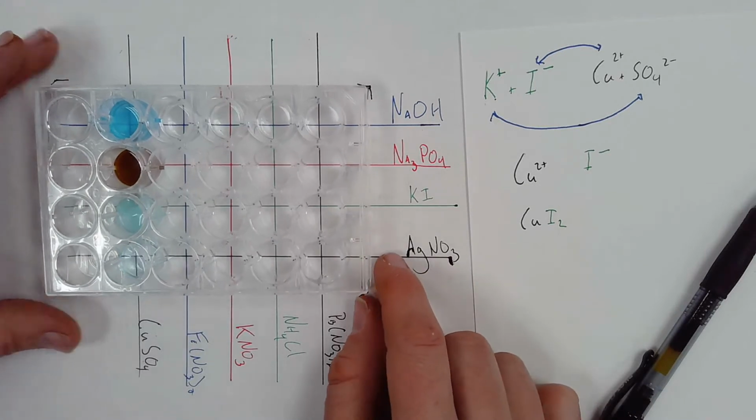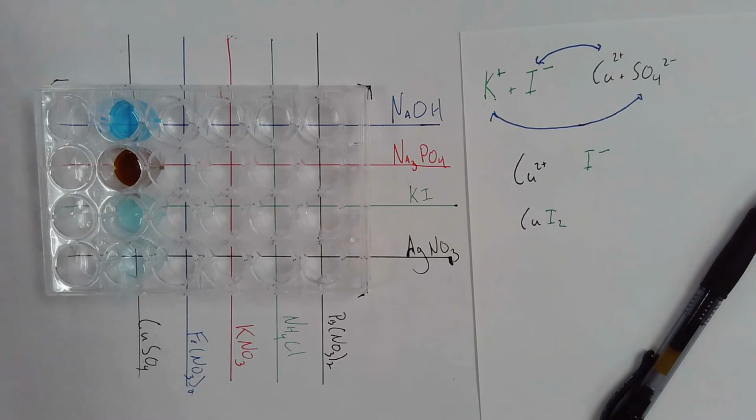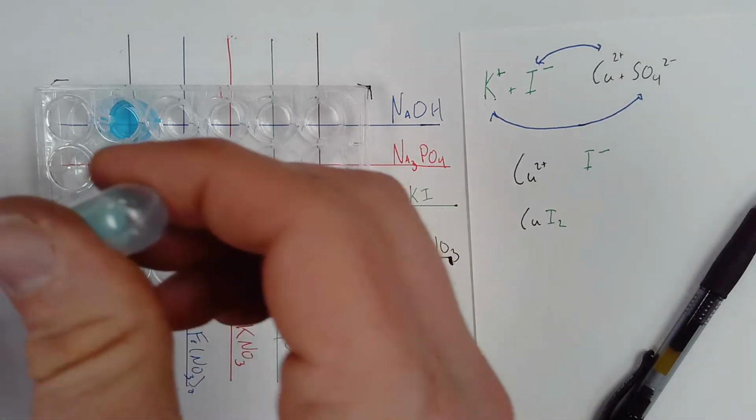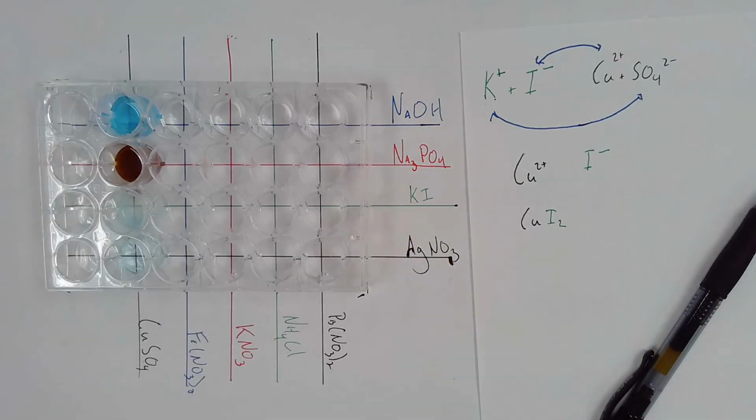Actually, hold that thought for a second. Future Mr. Nendick here. So you might have noticed a pause. What was going on there is I recognized that I put the wrong chemical in the wrong little bin. Right? The brown one is actually going to be the copper iodide, and this light blue one is the copper phosphate. I just put them in the wrong spot. It's not going to change anything in reality. Just know if you actually wanted to look at copper iodide in real life, it would be that brown color. So just to be clear, what I'm centrifuging right now is actually copper phosphate.